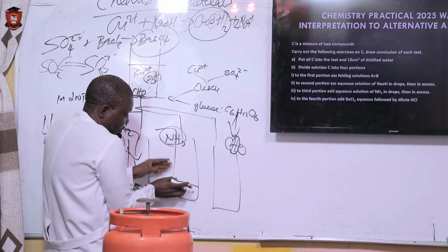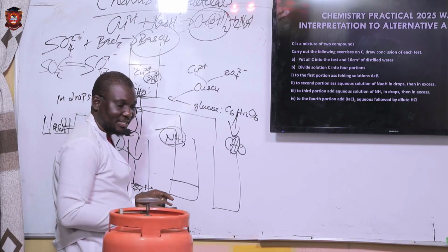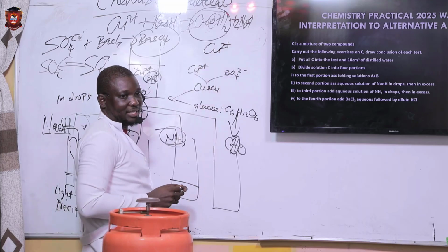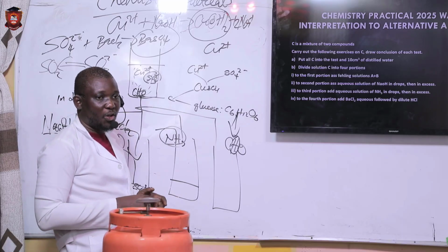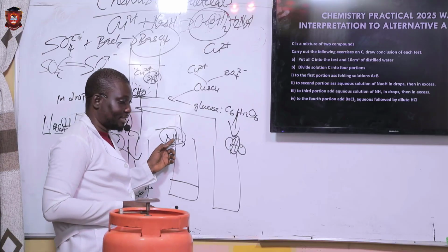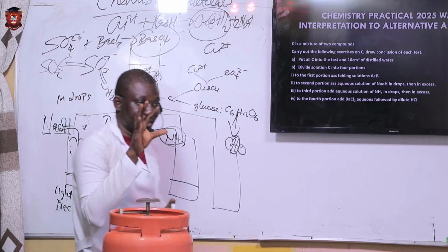That's why it's not giving you that gel-like precipitate. So if you add this, it's going to give you blue precipitate. Then if you add it in SS (excess), copper is one particular element that can form complexes with ammonia, being that they are d-block. So all complex ions are soluble. So you now see that in excess, the precipitate will dissolve, then give you a blue solution.